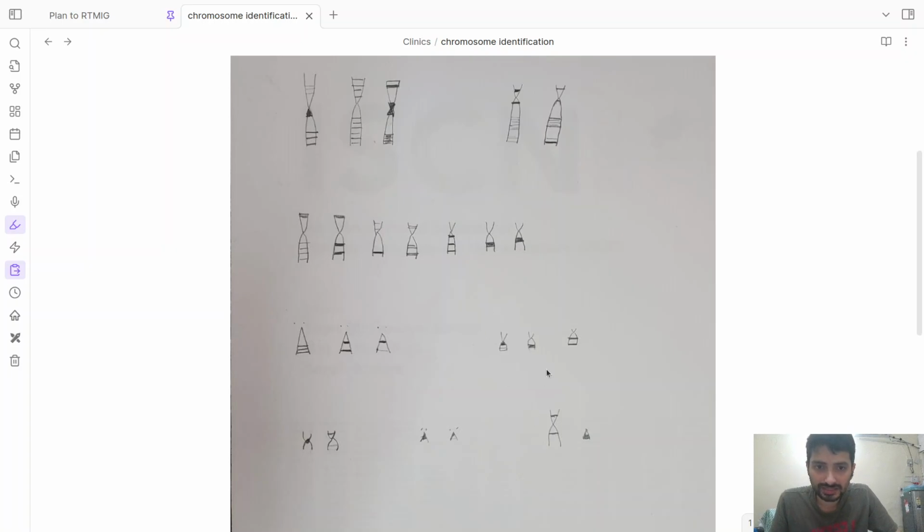So that is chromosome 16. And chromosome 17 again has a box band, but it's a smaller chromosome, which is submetacentric, and this would be the single defining band on this chromosome. Chromosome 18 has two bands, with the distal one being almost at the very edge of the Q arm, and that gives chromosome 18 away. So chromosome 18 is actually quite distinct when you look at it on the metaphase. This entire Q arm appears very box-like, and that gives chromosome 18 away very easily.